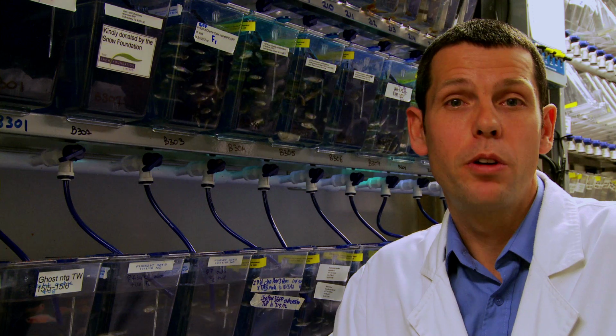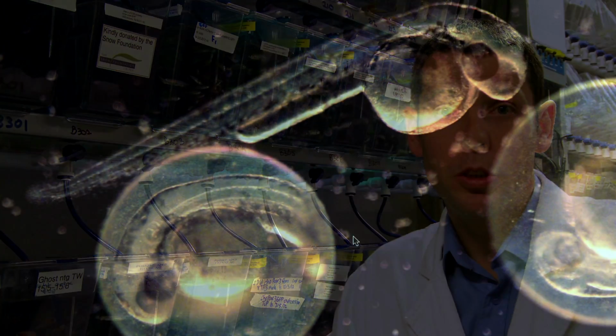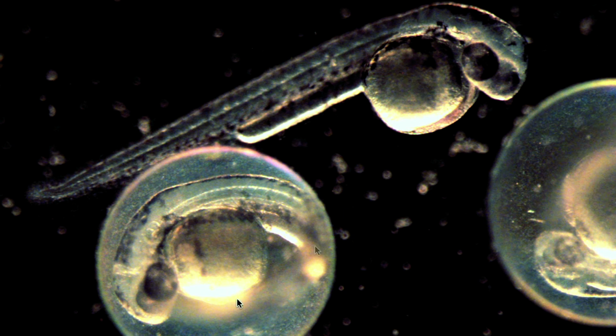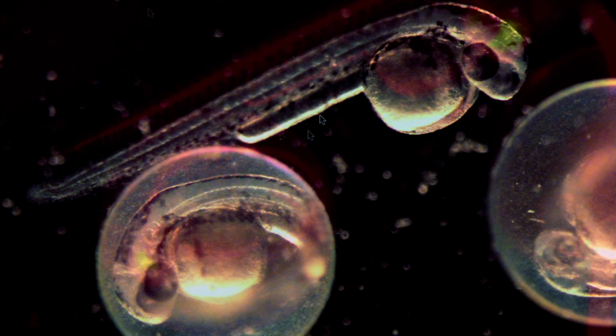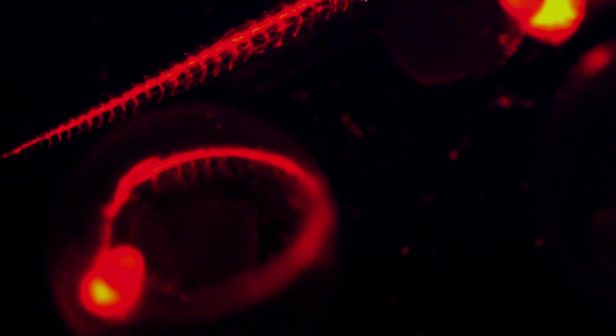technologies which allow us to overexpress genes in the zebrafish. So for example, in our motor neuron disease project, we are able to overexpress human proteins in the fish, and we know that these proteins carry mutations in the patients which cause motor neuron disease, and by expressing these same proteins in the fish we can hopefully understand motor neuron disease and search for a cure.